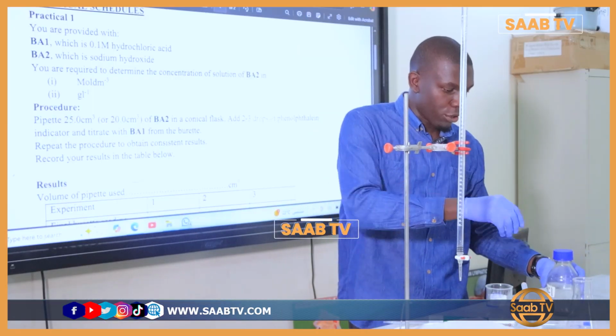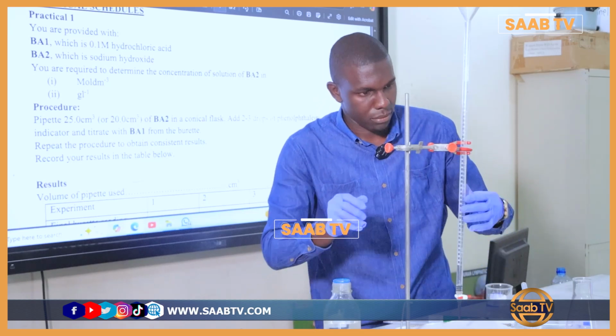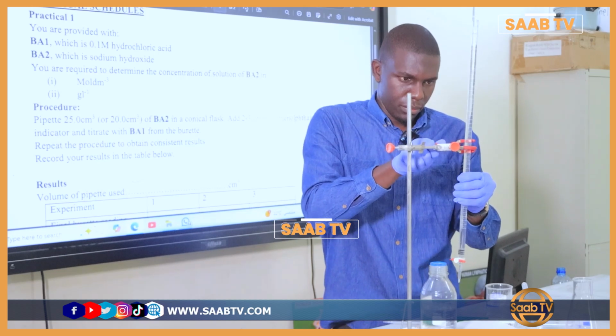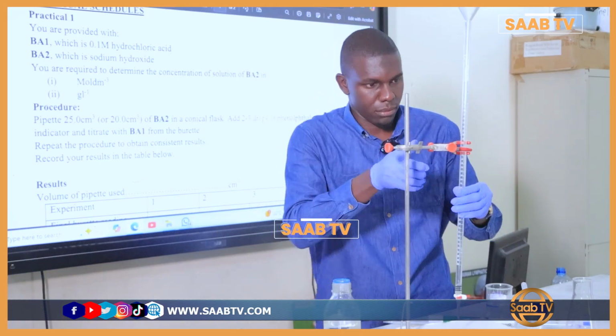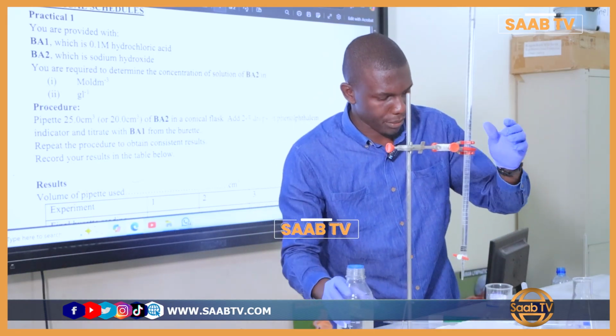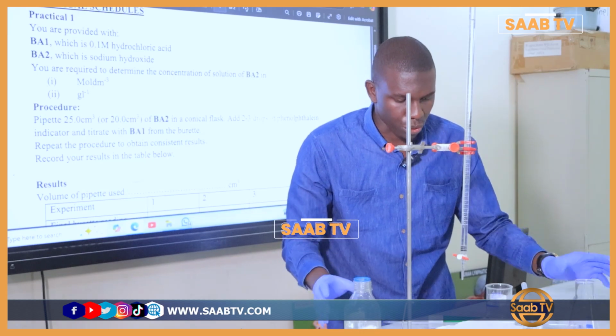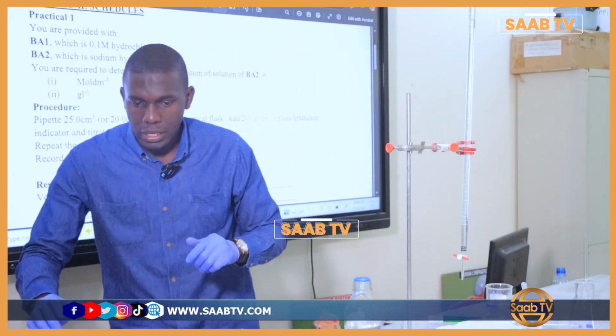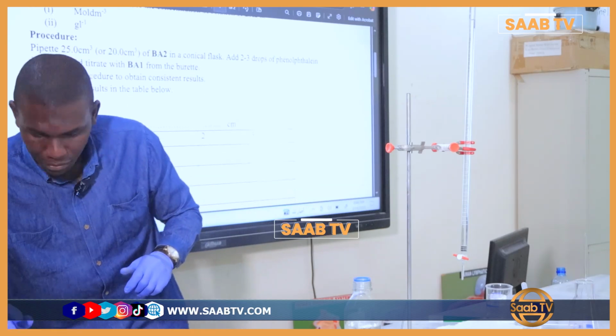I fill it with hydrochloric acid. So I've added it in, and I need to adjust it up to 0. So it is at the 0 mark. We are now going to take the initial reading. So this is our table of results we have here.